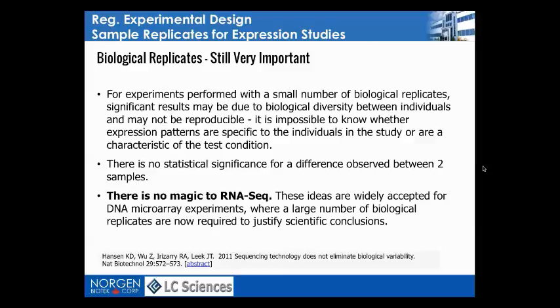So if you just send us a cancer patient sample and a control patient sample, you will probably see a difference. But of course you cannot draw any meaningful conclusions based on that, because the variation that you see might be just simple patient-to-patient variation. There's no indication that this difference would be caused by cancer in this example.